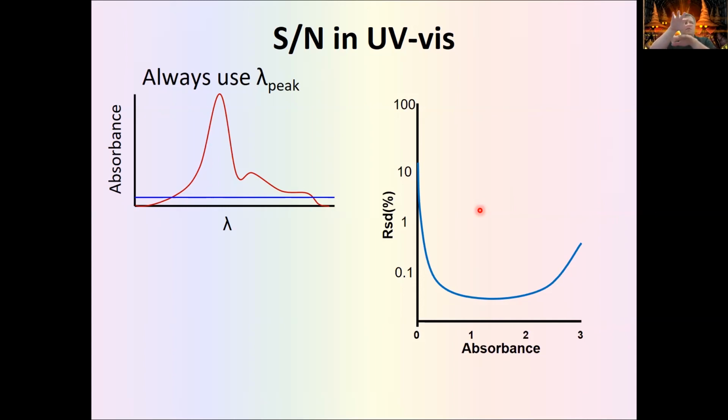And if those two lines or those two spectra are far apart, the uncertainty is not contributing a ton to that difference in between these, right? But if we're comparing a difference that's really small like this, and we still got a bunch of wiggling noise in there, that's going to give us quite a bit of noise when we have low absorbance.